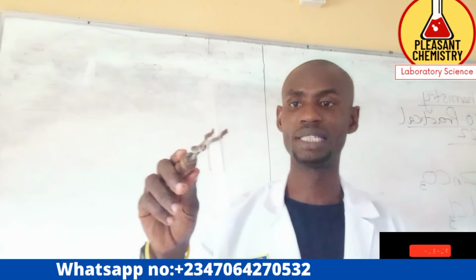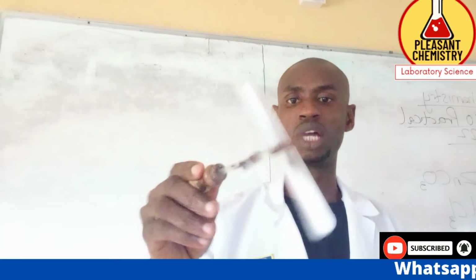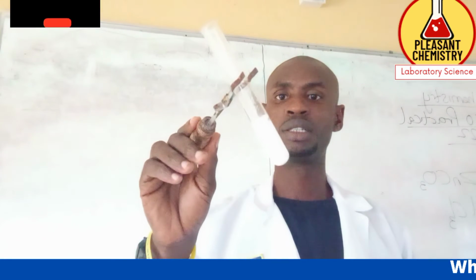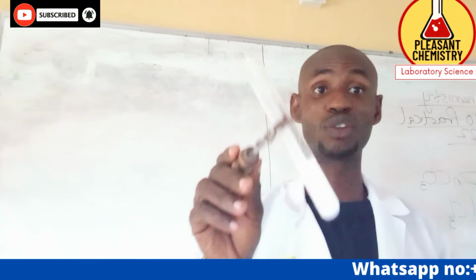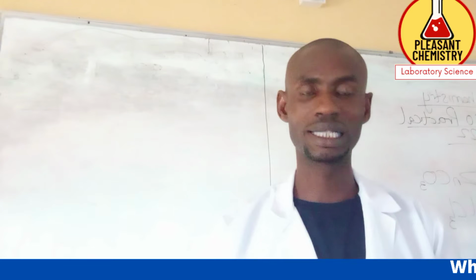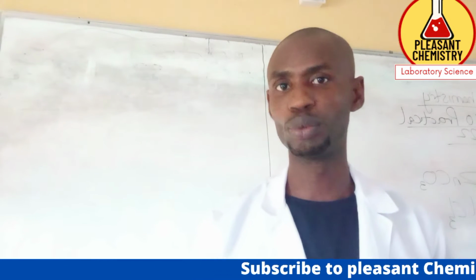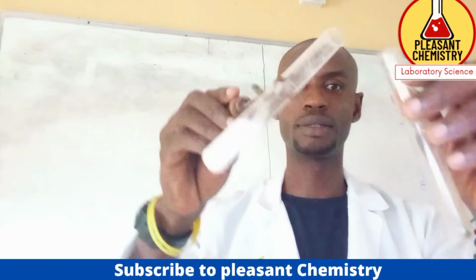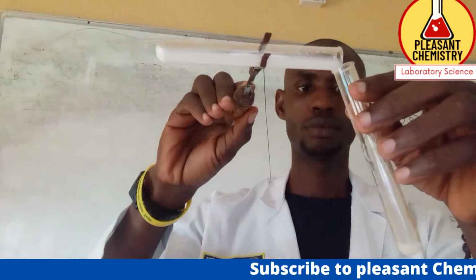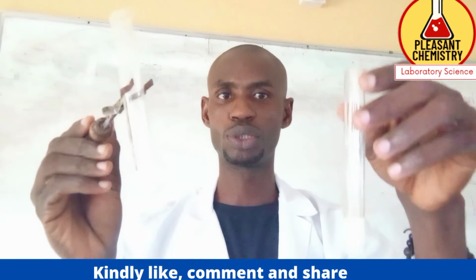So now this is my Y. I have added water to my Y, and Y is actually soluble. That is aluminium chloride; aluminium chloride is soluble. So the question asks me to add water to Y. Y dissolves completely to give a colorless solution. That's our observation. Our inference is that Y is a soluble salt. The next column asks us to divide Y into 2 portions. So we have divided Y into 2 portions now.